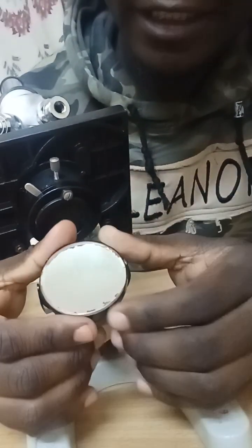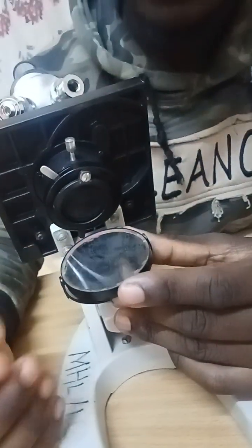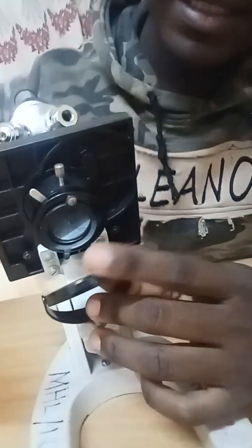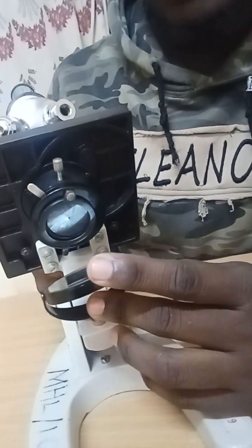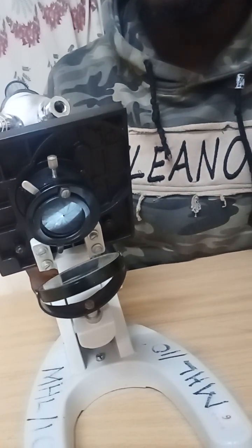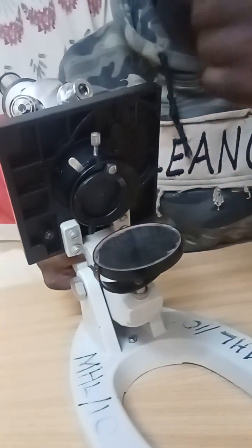Then at the bottom here, as you can see, we have a mirror, and the mirror is for reflection of light. This light is able to go onto the stage through the diaphragm, because it is a light microscope and it uses light to illuminate the specimen on the stage. So that is the role of the mirror, reflection of light onto the specimen on the stage.